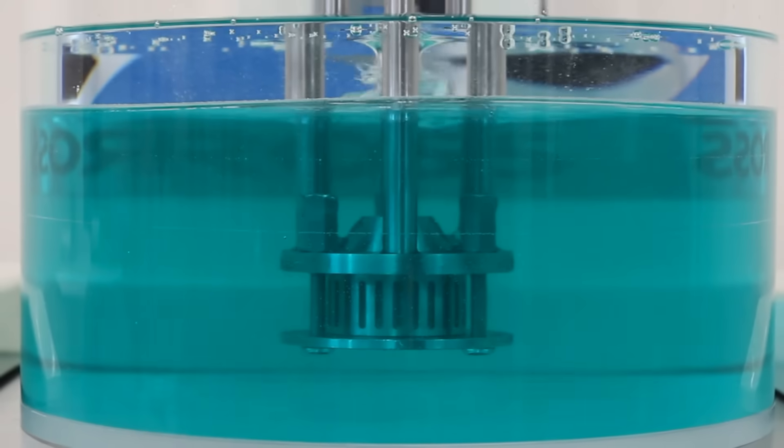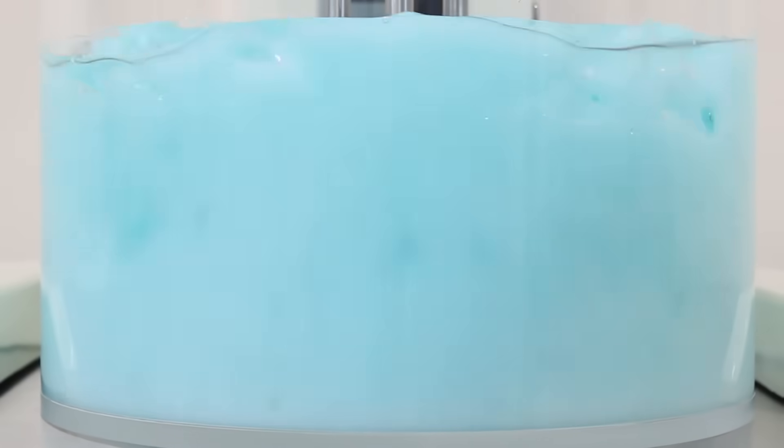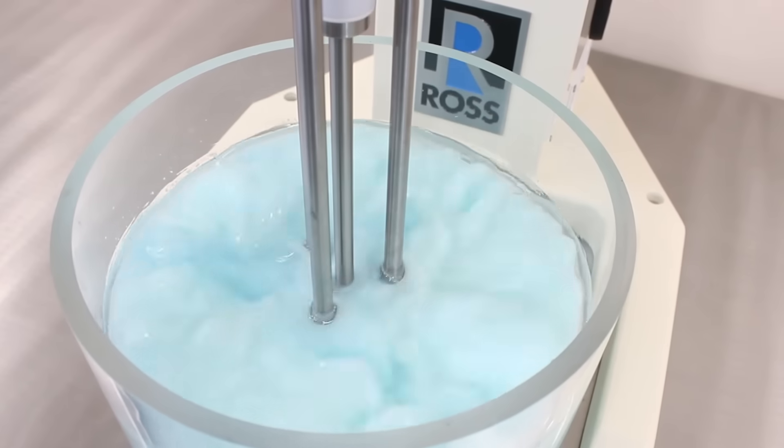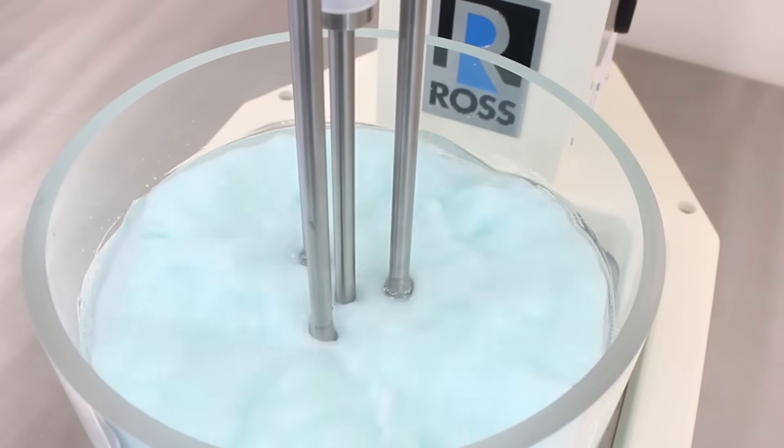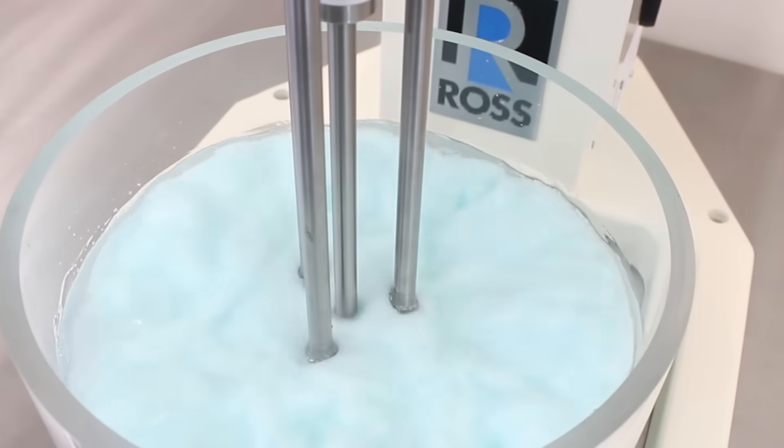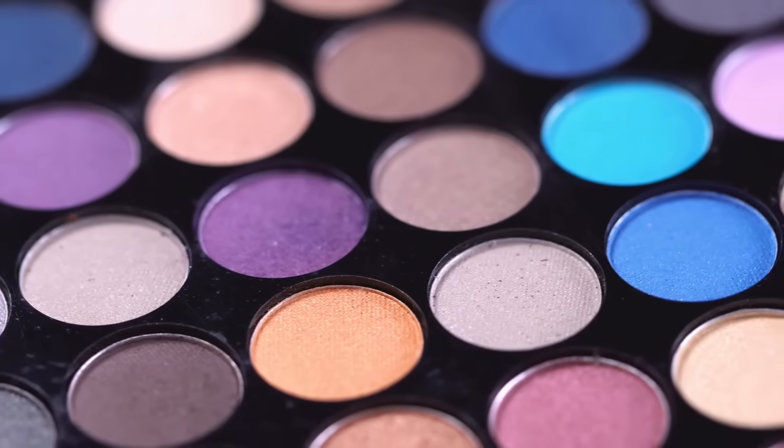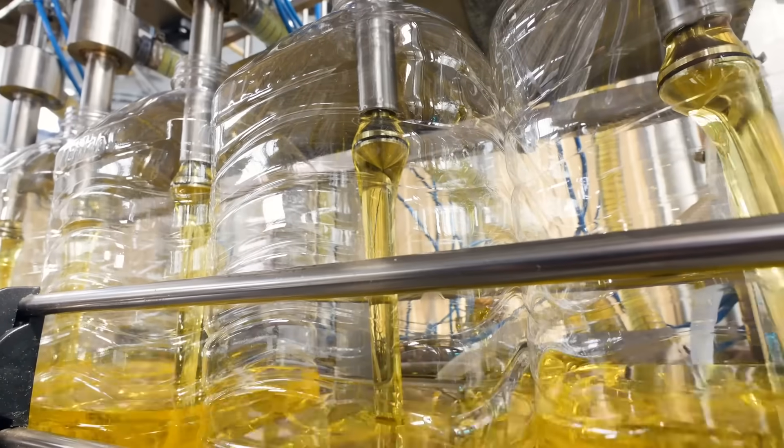The rotor stator design creates perfect emulsions and suspensions by homogenizing immiscible liquids and dispersing agglomerates in some of the toughest applications throughout the food, cosmetic, pharmaceutical, and chemical industries.